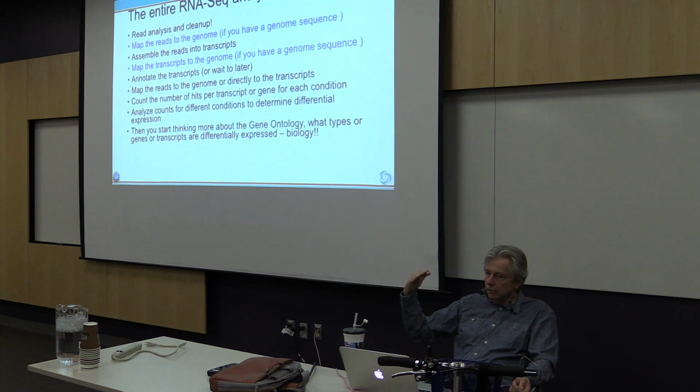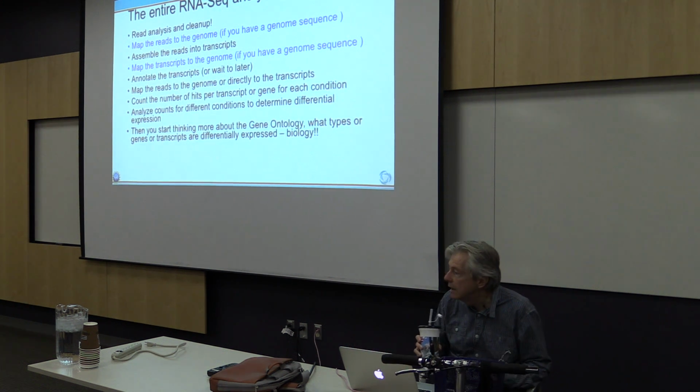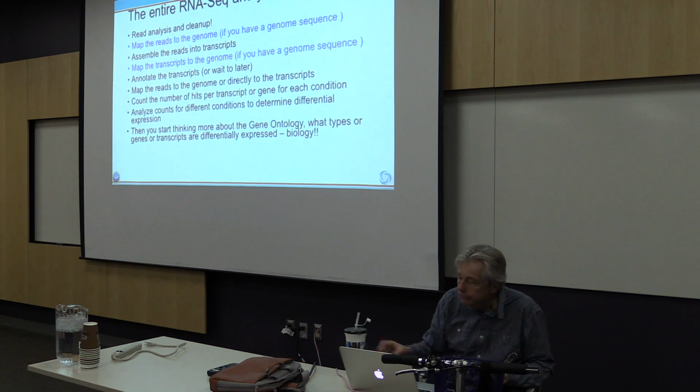And the reality is you'll have a lot of overlap. You'll have a whole bunch in certain areas of commonly highly expressed genes, and other areas that just get a few. And then a few areas where you just get like one hit or two hits out of nowhere. And so you have to keep in mind that some things are mapped accurately, some things aren't. And to some extent, your cleanup process can determine how accurate your mapping is. And your settings, too, when you run these programs.